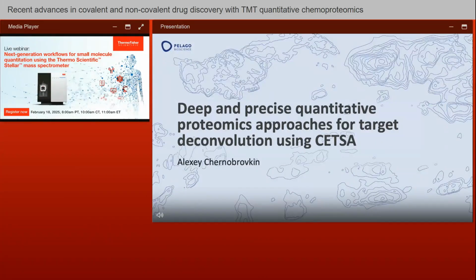I'm principal scientist at Pelago Bioscience, and in today's presentation I'll tell you about target deconvolution based on cellular thermal shift assay and different quantitative proteomics approaches we are using for it.